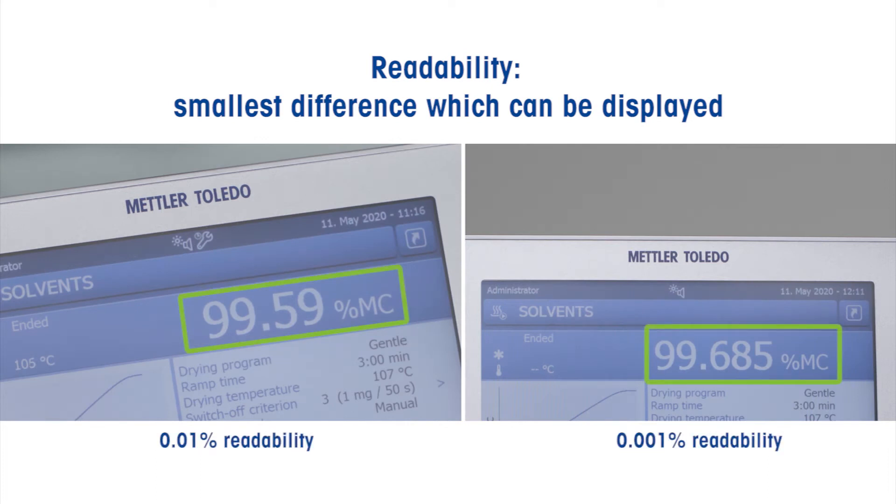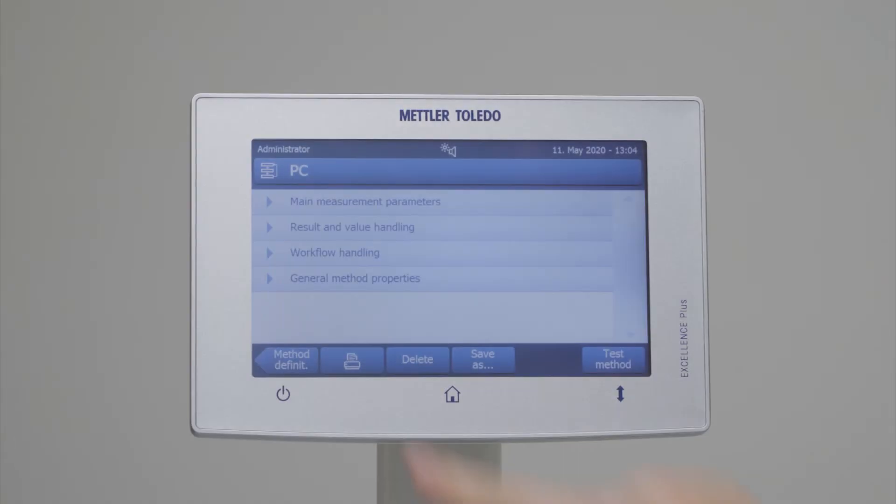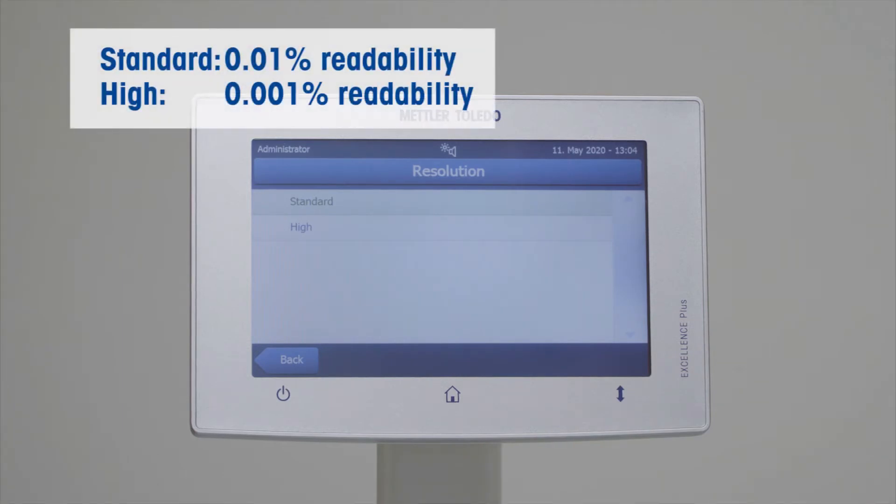The readability is the smallest difference which can be displayed on your device. It can be given in grams or percent moisture or dry content. Do not confuse readability with repeatability. Readability is simply how the result is displayed.